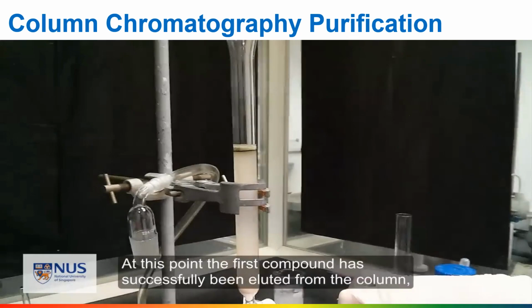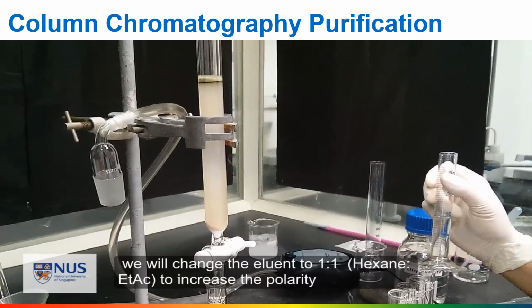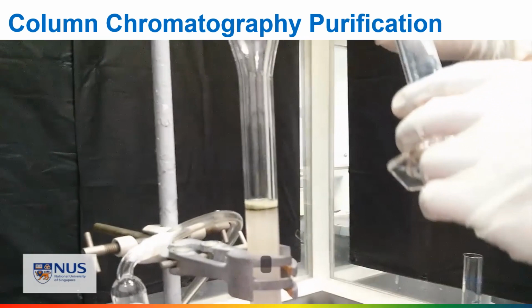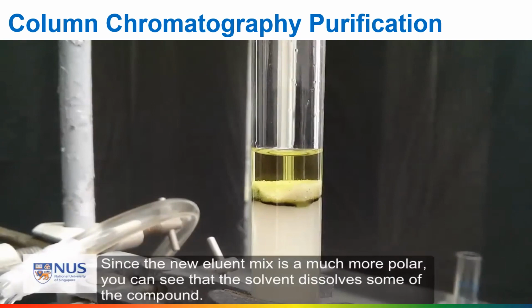At this point, the first compound has successfully been eluted from the column. We will change the eluent to a 1:1 hexane to ethyl acetate ratio to increase the polarity, so that the more polar compound will interact better and can be eluted. Since the new eluent mix is much more polar, you can see that the solvent dissolves some of the compound.